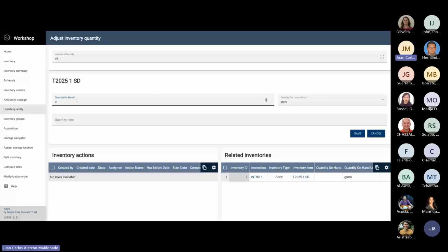Again, this is important: using the barcode labels, the user doesn't need to type anything, only needs to read the barcode. For this example, since the electronic balance is not here, I would type the quantity, say 500 units.